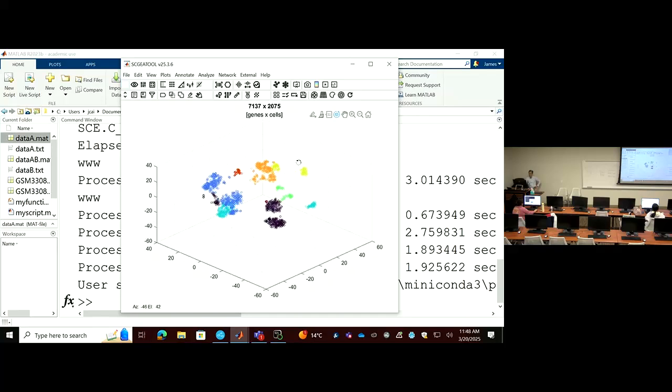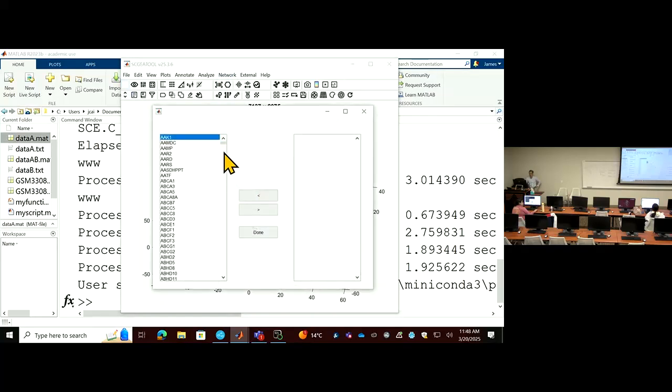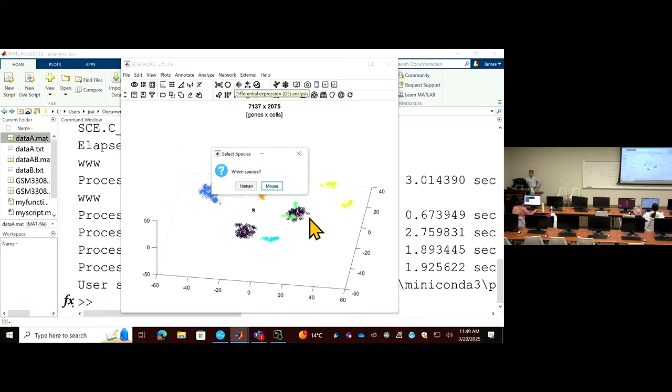Okay, so this one is mouse data and contains few genes, few cells. Still, if you look at the genes, it's already very clean, but let's make it smaller. You can basically run on this, but for the purpose of demonstration, I will use network and also remove some genes to reduce the search space to make this quick enough.